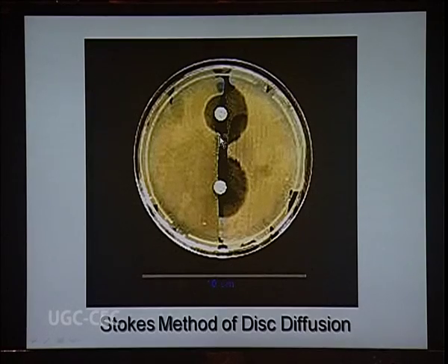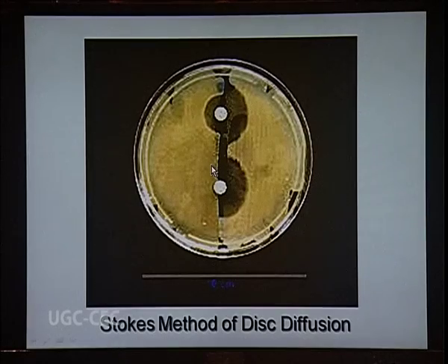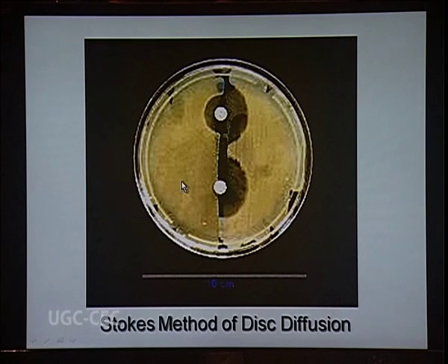Here, in one plate, we can have both control culture as well as test culture together. On the upper as well as lower one third of the agar, we can use the control culture, and in the middle, we can use the test culture. Sir, here we can only observe one specific microorganism with respect to different antibiotics. The beauty of this method is that you can actually have both control as well as test culture in a single plate.